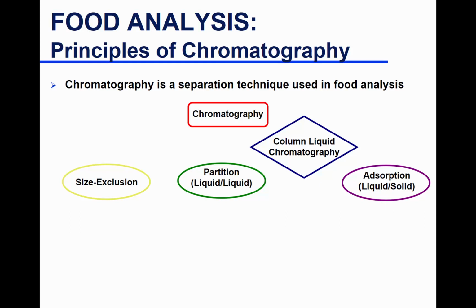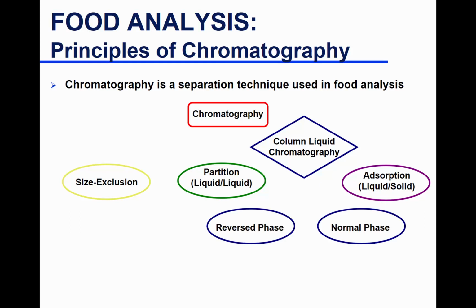So it has multiple names, but they mean the same thing, separation based on size. Okay? We already talked about partition chromatography, where one compound will be more soluble in one liquid than the other.